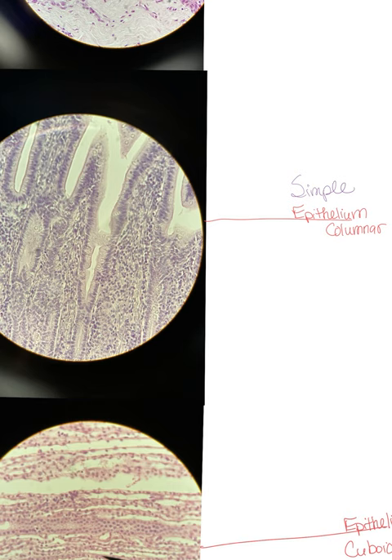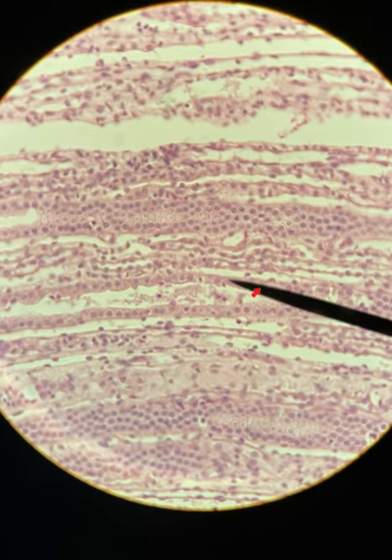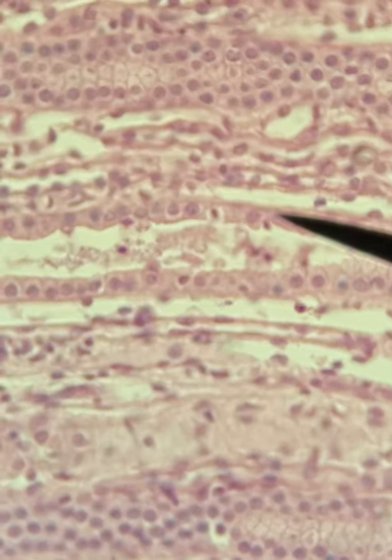Another guy that is also really big for absorption and secretion, you can see we have a pointer here pointing directly to this little cell. You can tell even better right here that we're looking at simple cuboidal. So it's just one layer. How can you tell it's one layer? Of course, there's a lot of layers, right? There's so much going on within a tissue. That's why you will look at this empty space, and particularly if there's a pointer, if your TA is nice, they will have it pointing directly to a cell. So these are simple, one layer of cuboidal cells. You're going to find these in all of your ducts and glands, and they function as absorption and secretion cells.